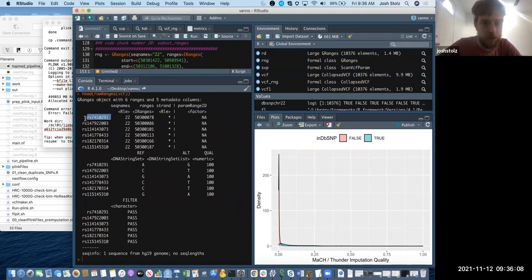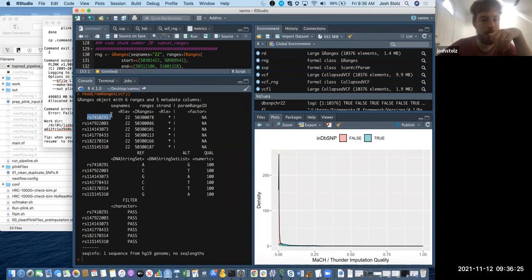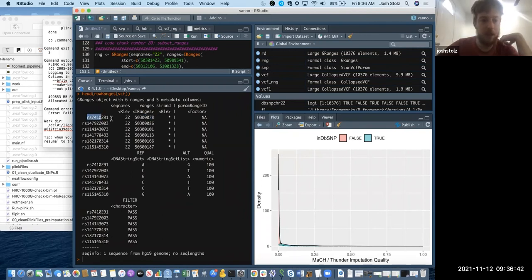The question is how would you specify this in GRanges, because then you could just call it by RSID. I mean you could just do the specific sequence name with the range and that would get it, but I have to believe there's a way to just name the SNP and call in one.